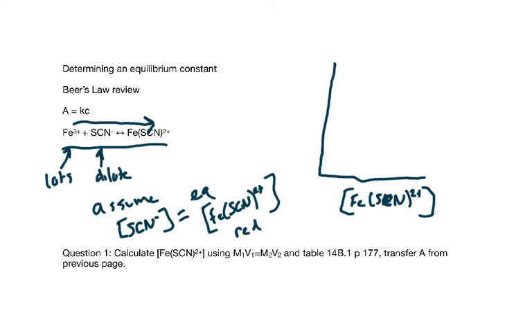and our x-axis and our absorbance, which we will get by putting the solutions into cuvettes and reading the absorbance at 450 nanometers. I will show you how to do that in lab as a reminder, or if you haven't used this before, as a demonstration. And we will get, let's see, we have 5 test tubes. You can assume it goes through 0, 0, 1, 2, 3, 4, 5. We'll get a series of points.